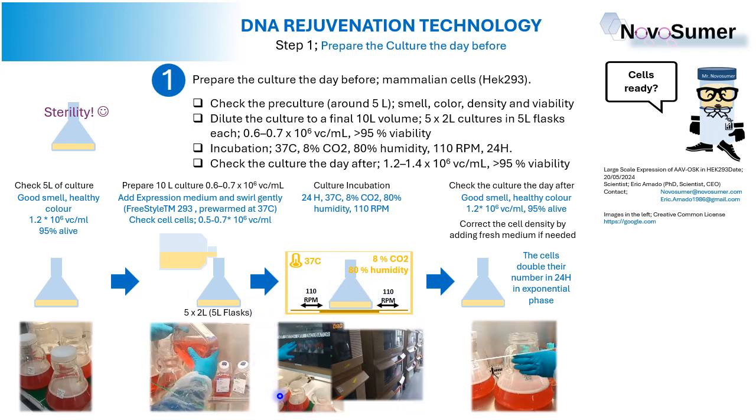You see here, this is the culture inside the incubation chamber, and we set the incubation chamber at certain parameters. Okay, this is the display. Here we will set the chamber. And as you can see here, there are many chambers, so you can have a taste of how they look like.